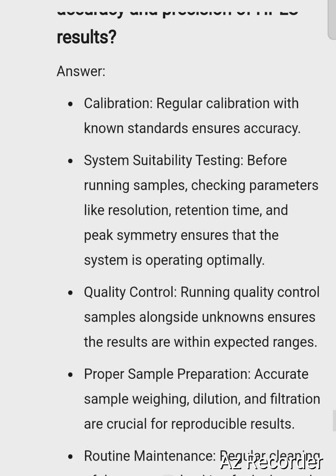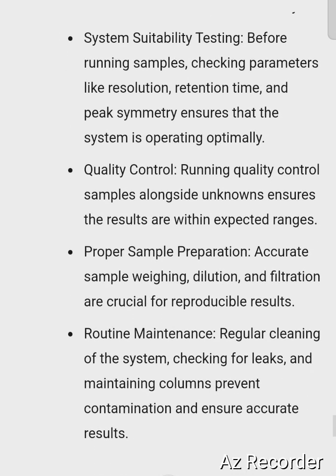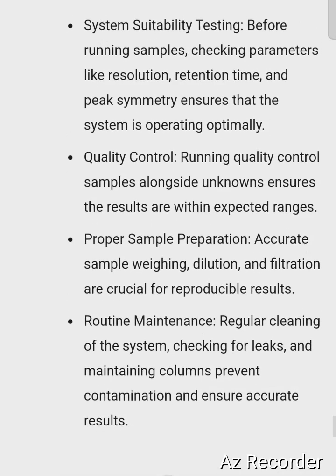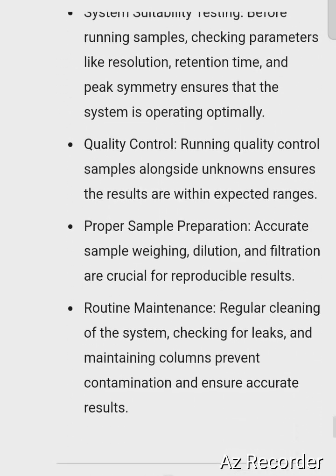Now running quality control samples alongside unknowns ensures the results are within the expected range. Then proper sample preparation: accurate sample weighing, dilution, and filtration are especially important for reproducible results. Then routine maintenance, regular PM, that will be better for best analysis. That is the main procedure.